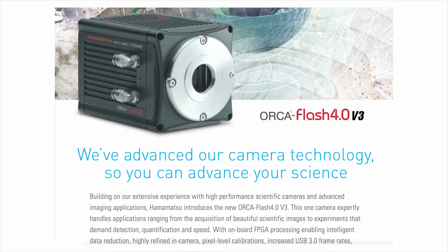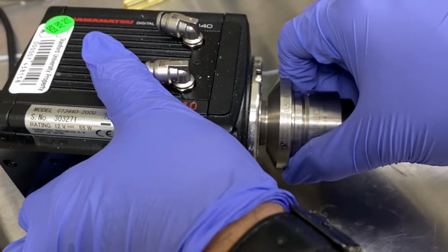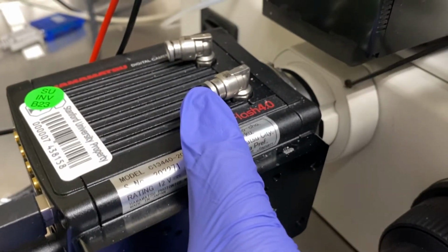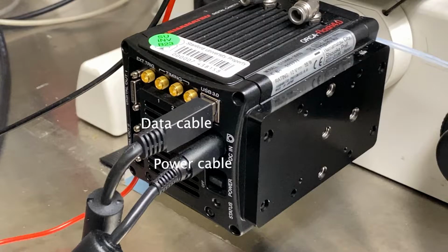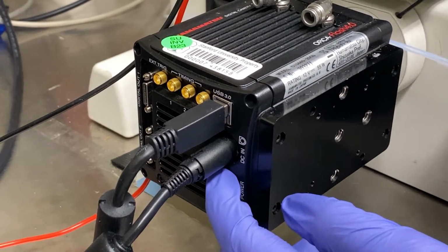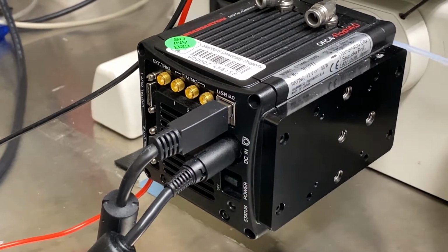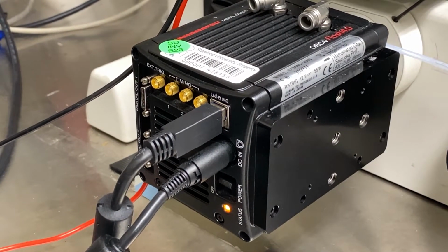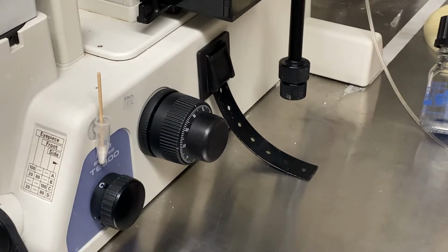We here also use an Orca Flash 4.0 V3S CMOS camera. To set up the camera, first mount the demagnification lens. Then use the set screw on the microscope side port to fix the camera in place. Turn on the camera using the on-off switch at the back of the camera head. The PC should provide a noise indicating it has detected the camera. Remember to set the microscope optics to output the image to the camera side port.